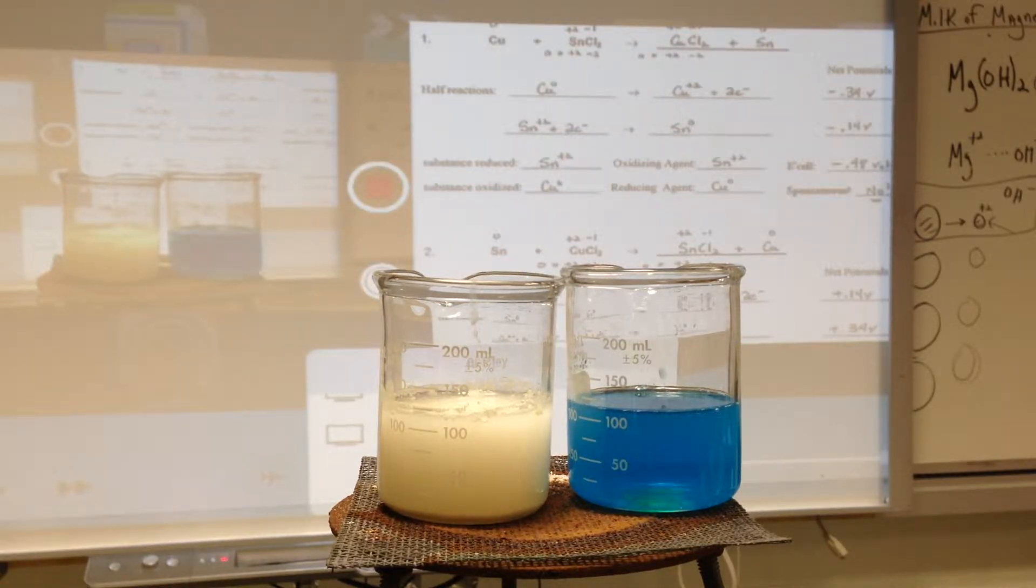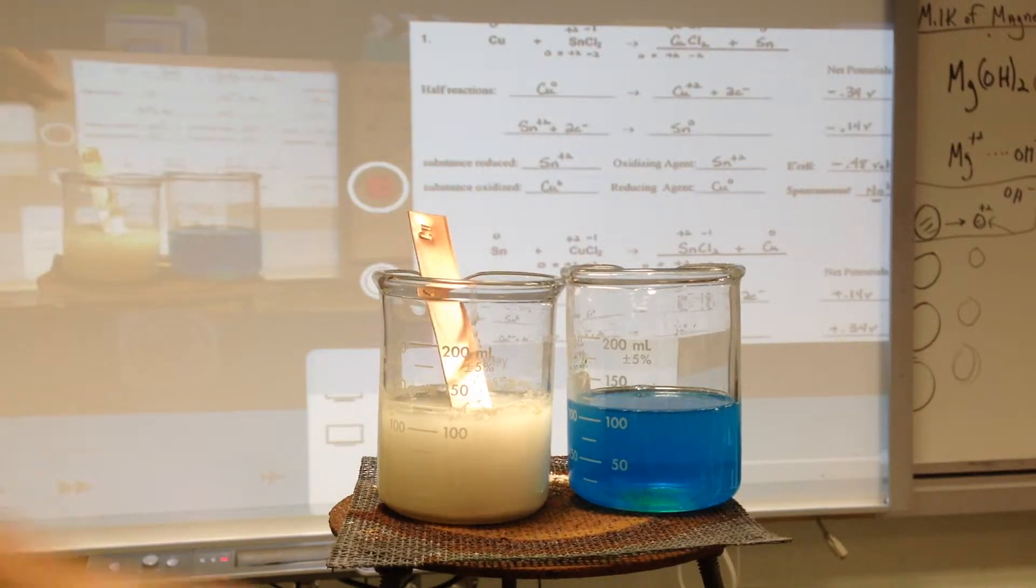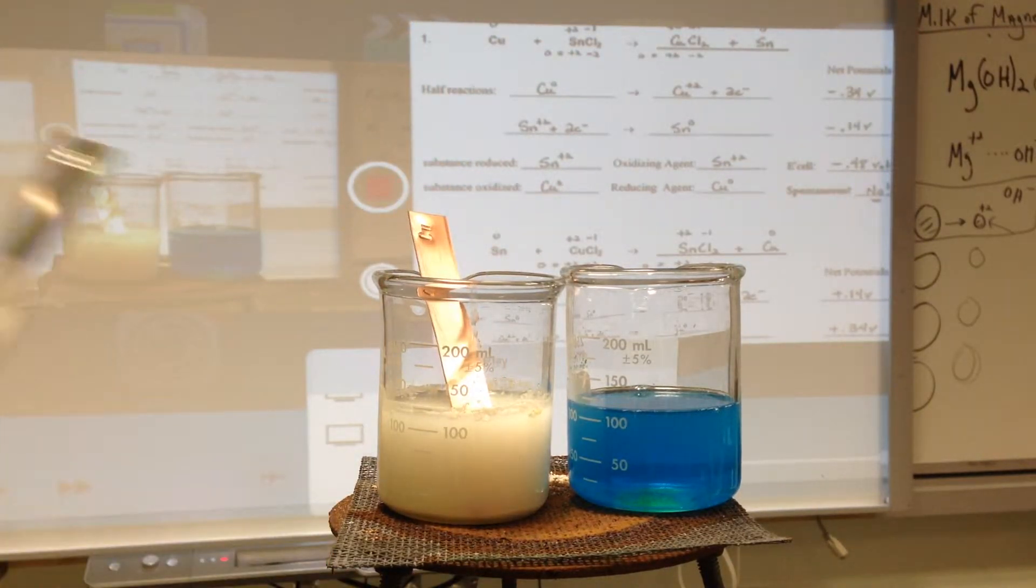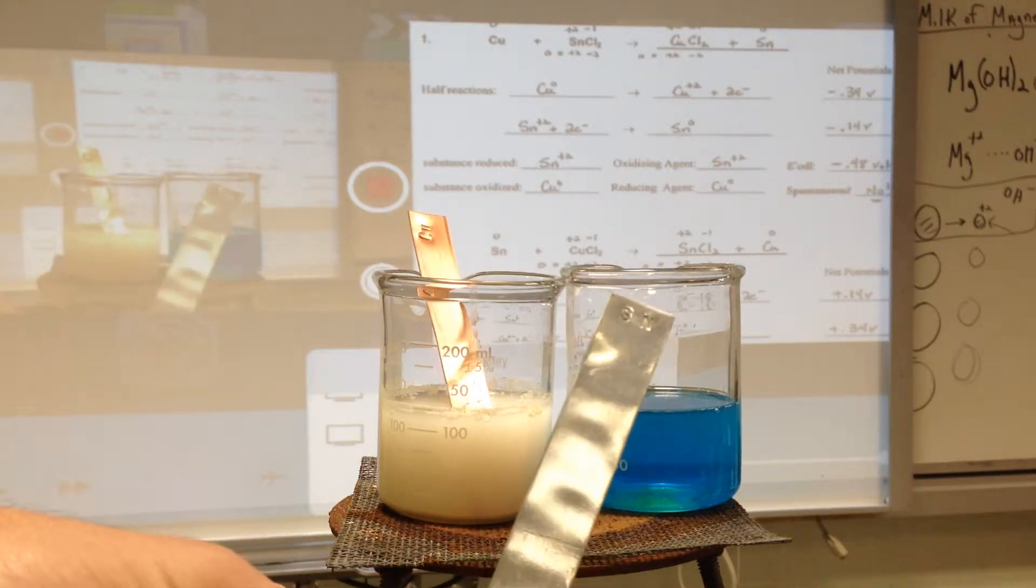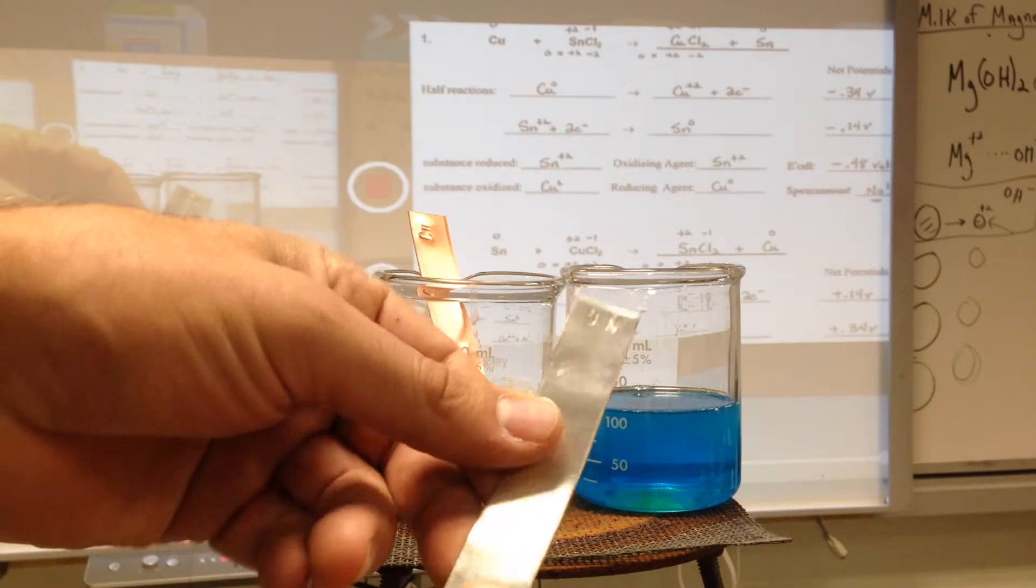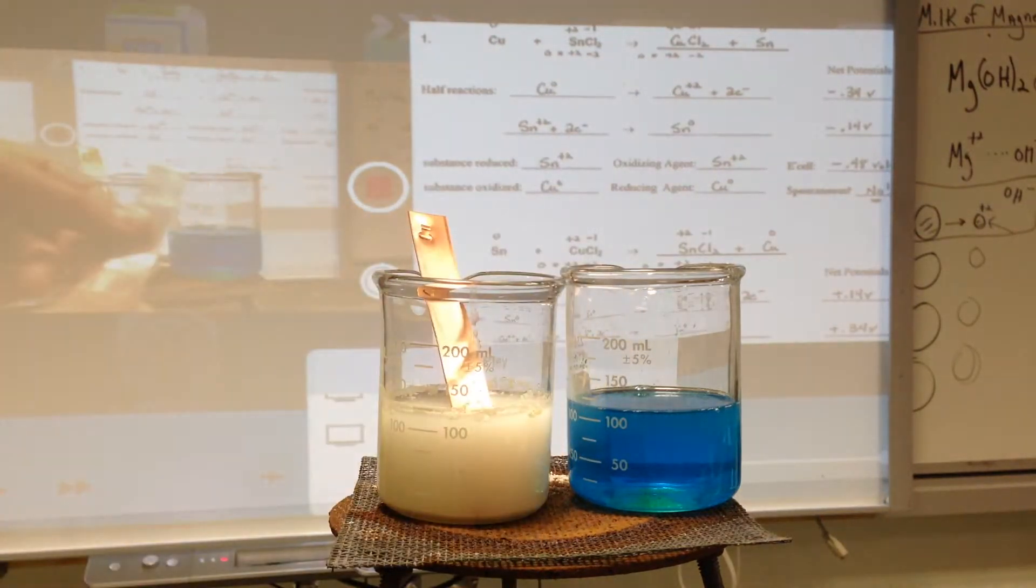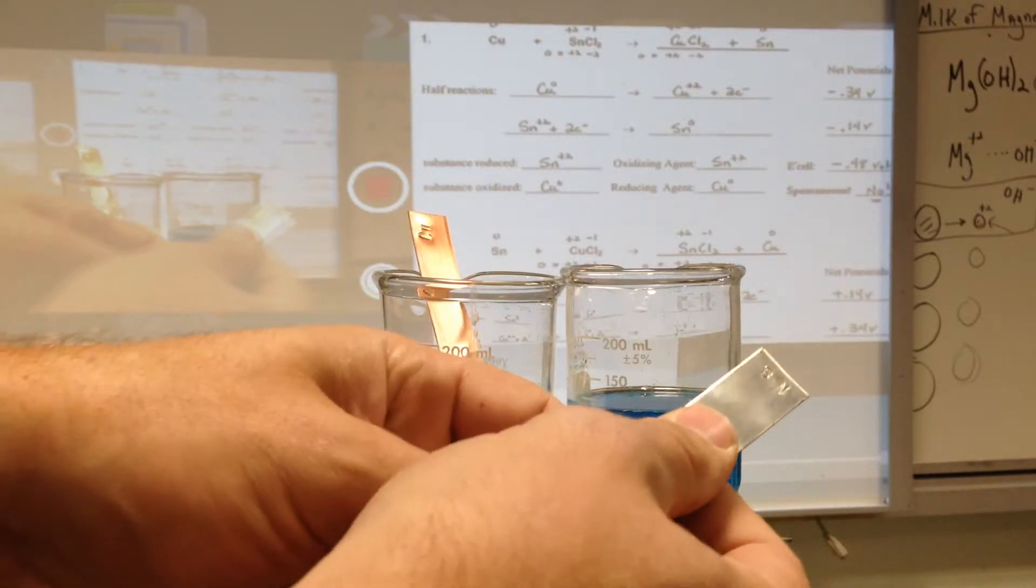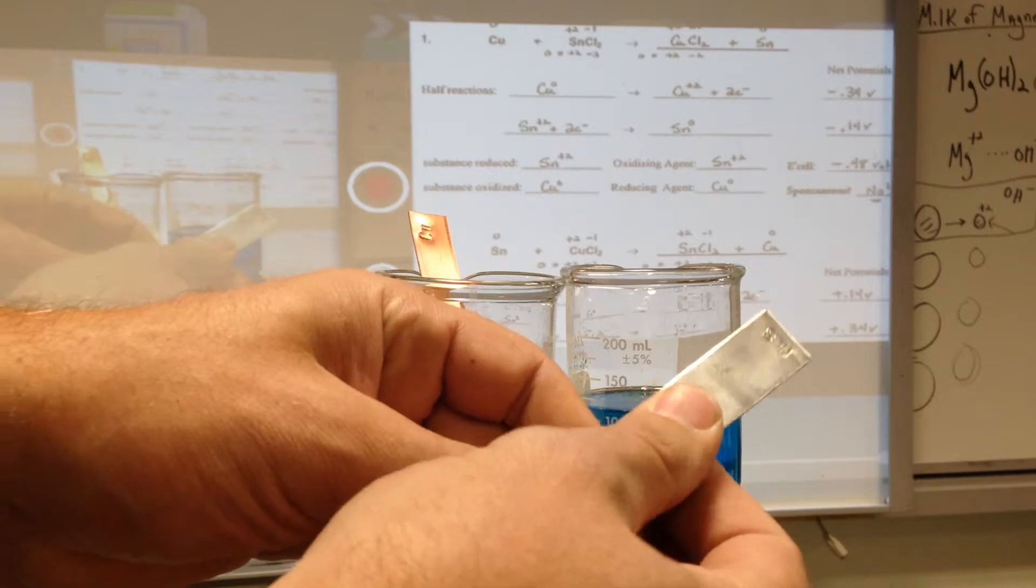I'm going to put copper in the tin plus two solution, and I'm going to put tin, which is one of my favorite metals. A lot of luster, a lot of shine, and it bends very easily. If you played with it you'd feel the same way. This is a very thick piece of tin, and it's very pliable.